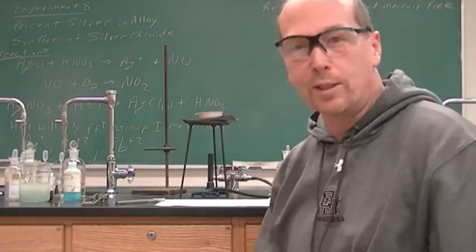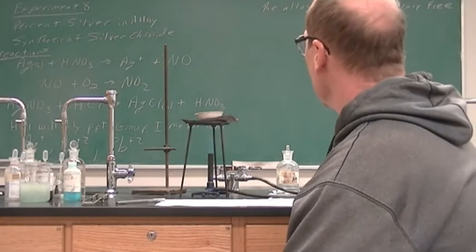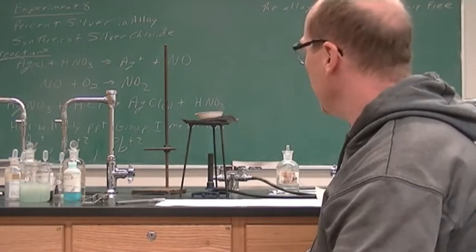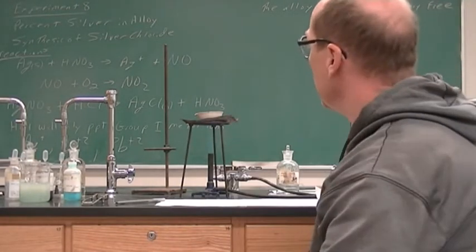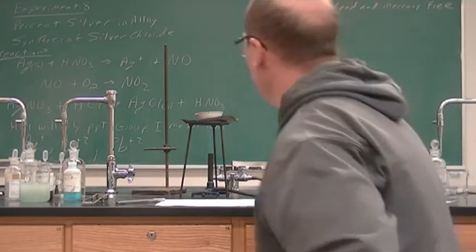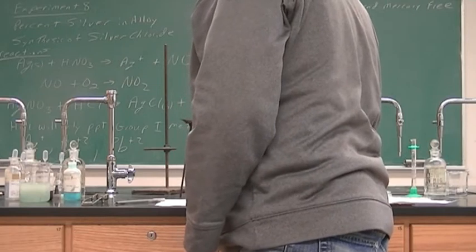This gives you a feel of what it's like to be in lab. You have to wait until it evaporates. There's no fast forward if you're actually in the lab. All right. So it just takes a while to get this to evaporate completely. But once that evaporates, then we gotta wait for it to cool. And then after we wait for it to cool, we can weigh it, then dissolve it, and then we have to do our reactions. After we dissolve, we do the reaction with HCl, and then we'll need that mass as well, and then we are done. So it's getting much lower.